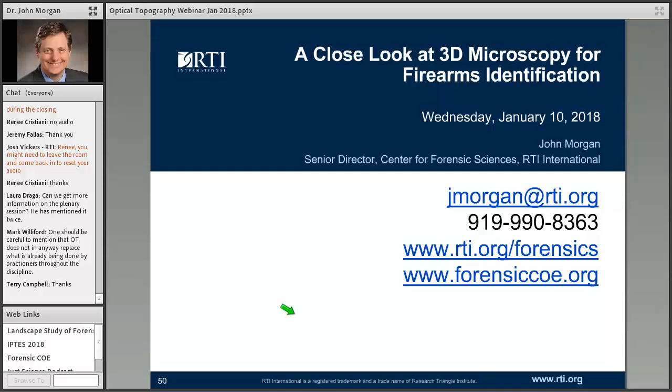If you don't have a human examiner in the loop judging what that DNA mixture interpretation software is telling you, then you're going to get it wrong 99 times out of 100. And so it's very important to have a human examiner in the loop being on top of what the algorithm is telling you. At this point in time, what I would say is that the systems are very, very useful for use as a reference database and to complement the comparison microscope, and therefore you're still looking at using this data in the same way as you would look at a comparison microscope image. You're doing a qualitative examination based on the judgment of a human examiner.